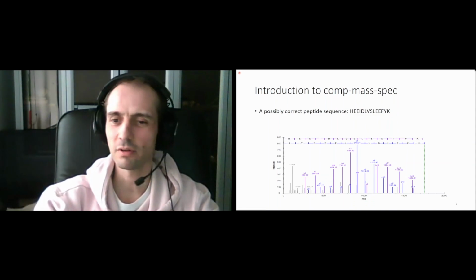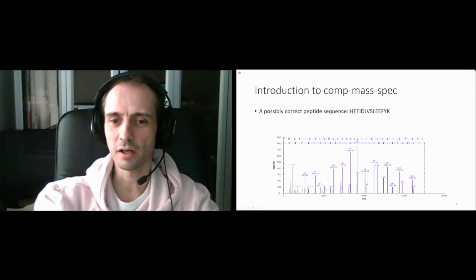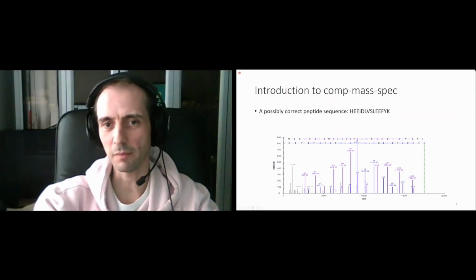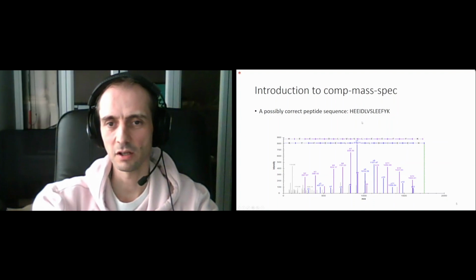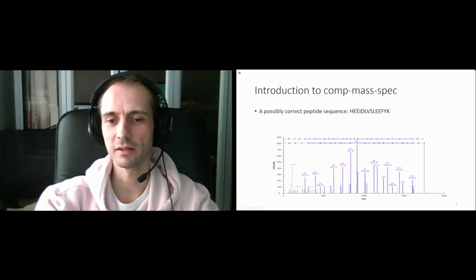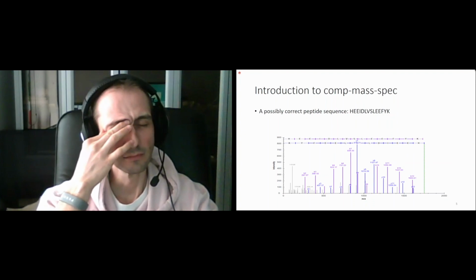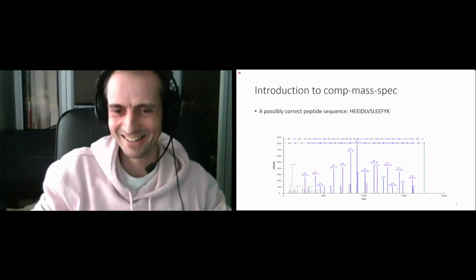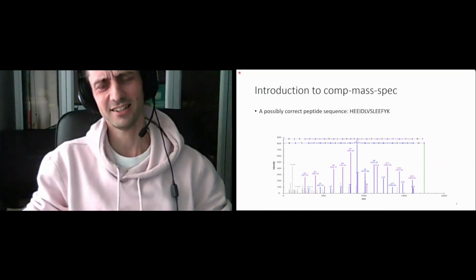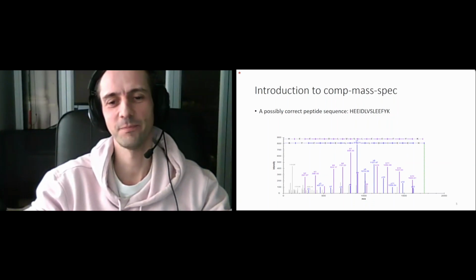So what's on the horizontal axis? The mass per charge of the fragment ions. The fragments. Say it again. This mass per charge, basically. You can consider it as a mass of the fragments. Sorry. Yeah. Okay. I was thinking about light spectrography. Yeah. No, so they're charged particles that bend in a magnetic field. Yes. Exactly. Now I got it. Okay.